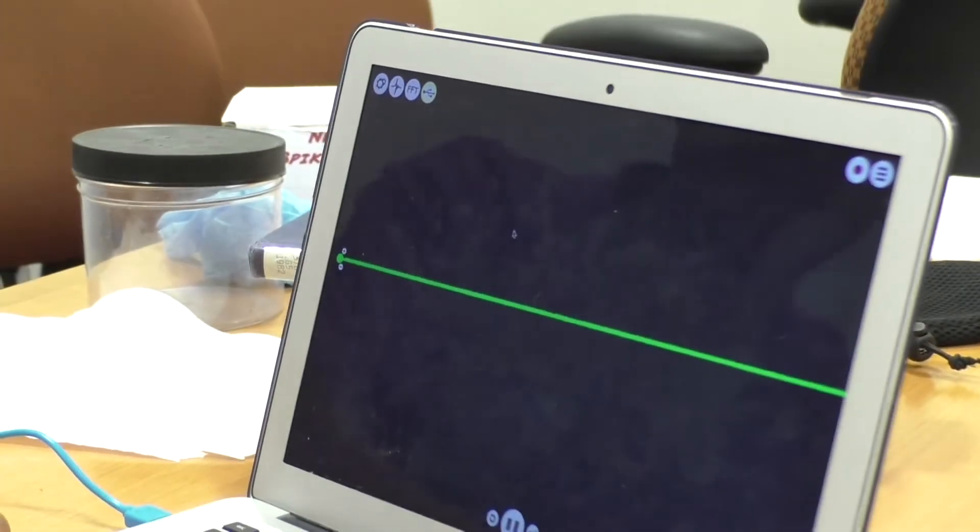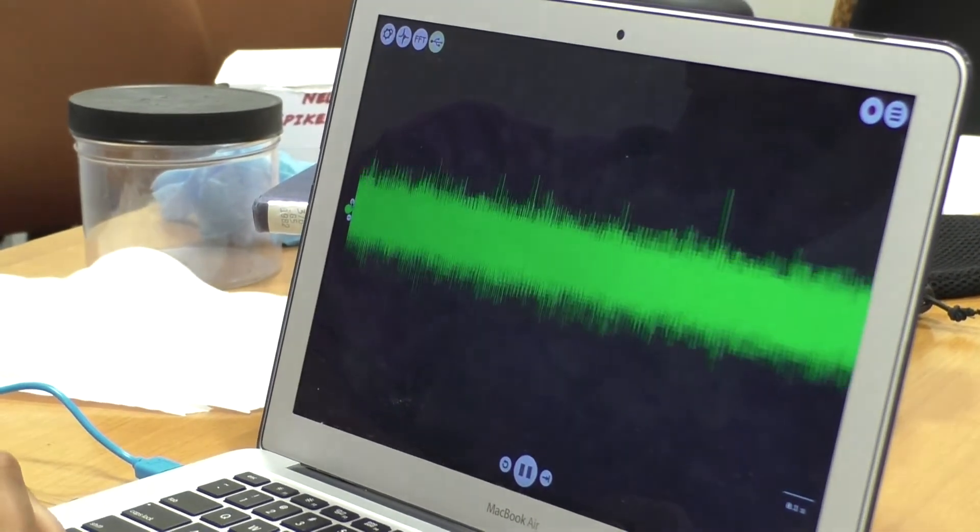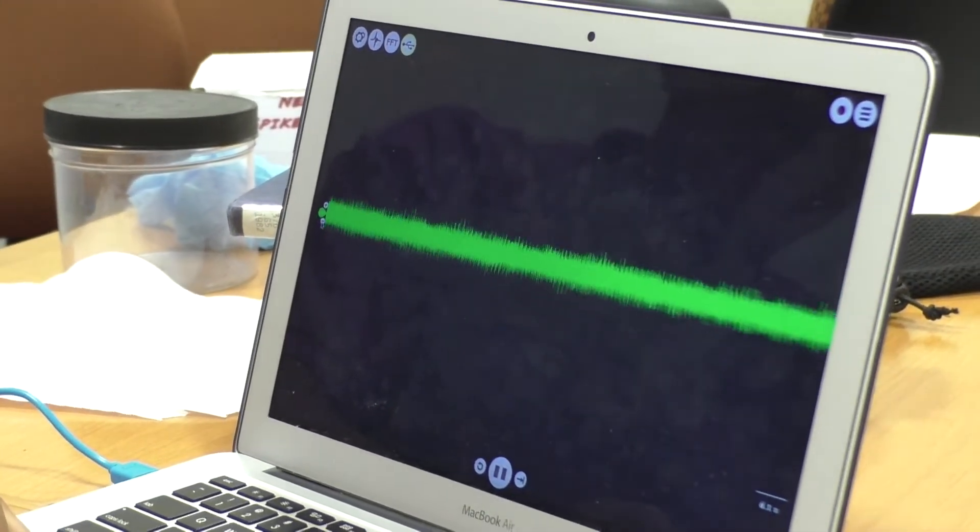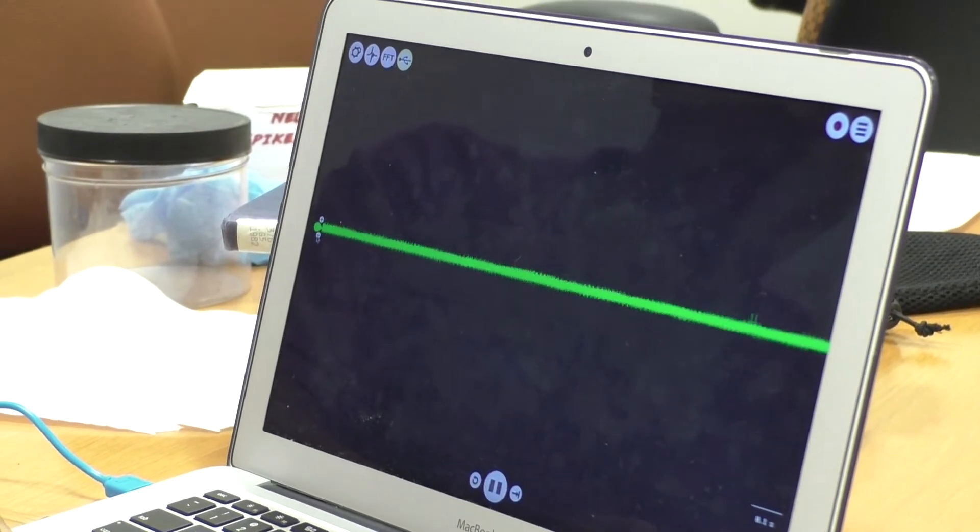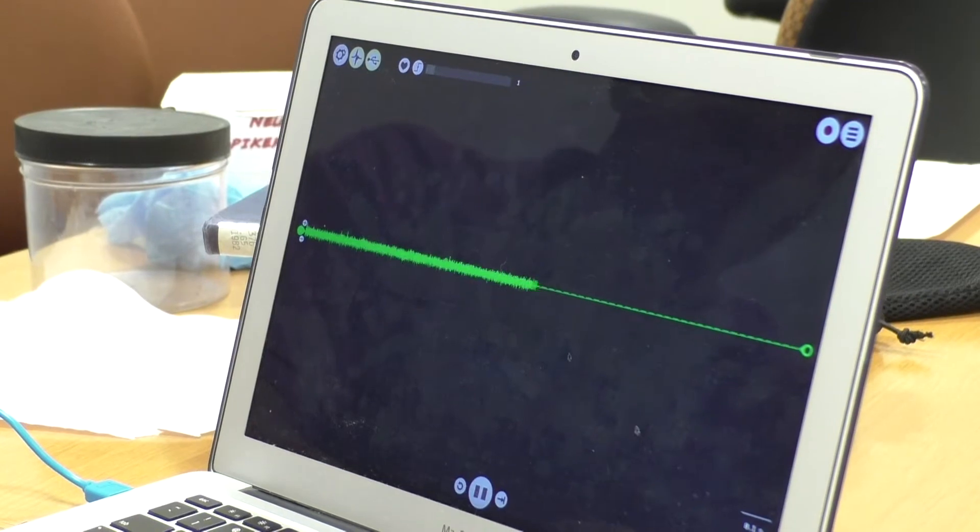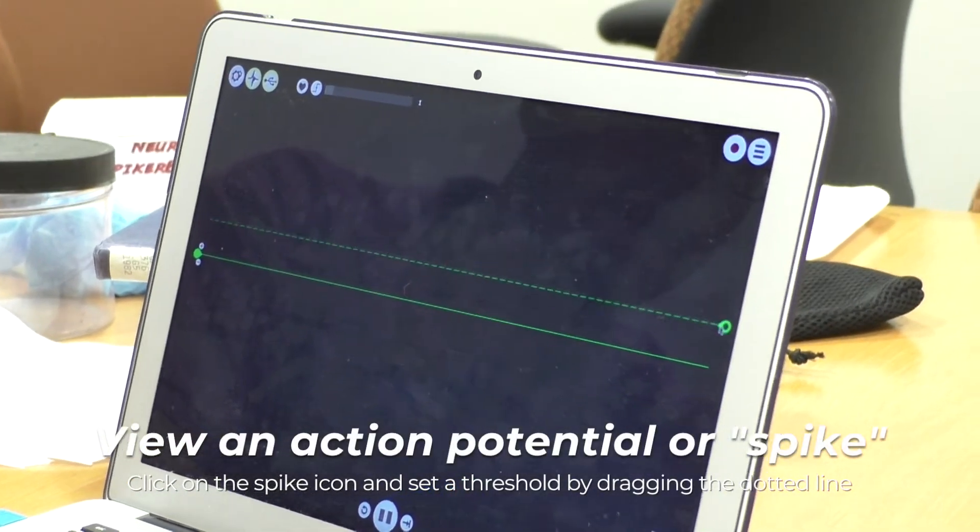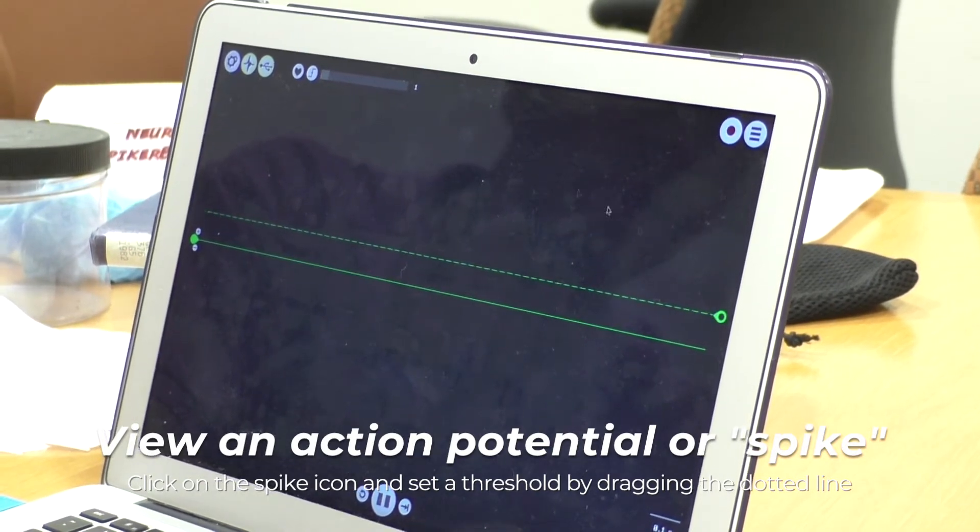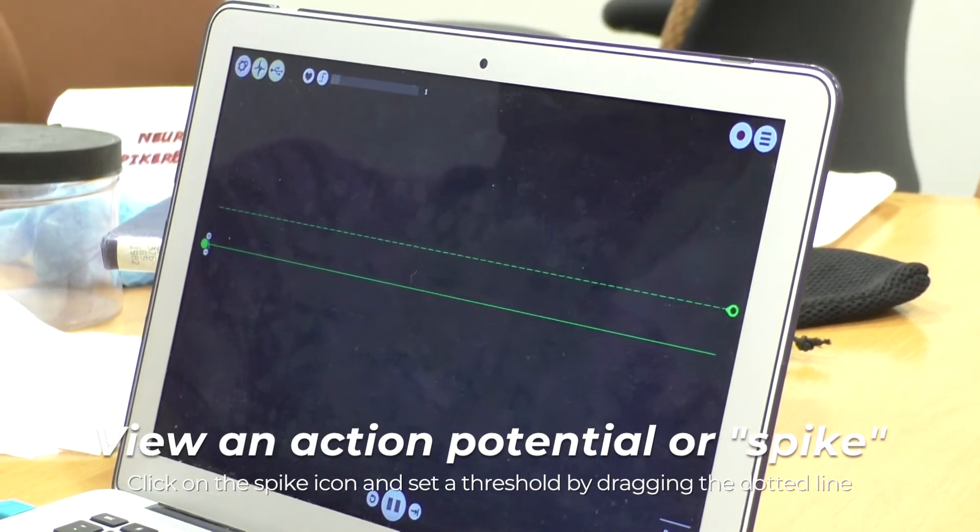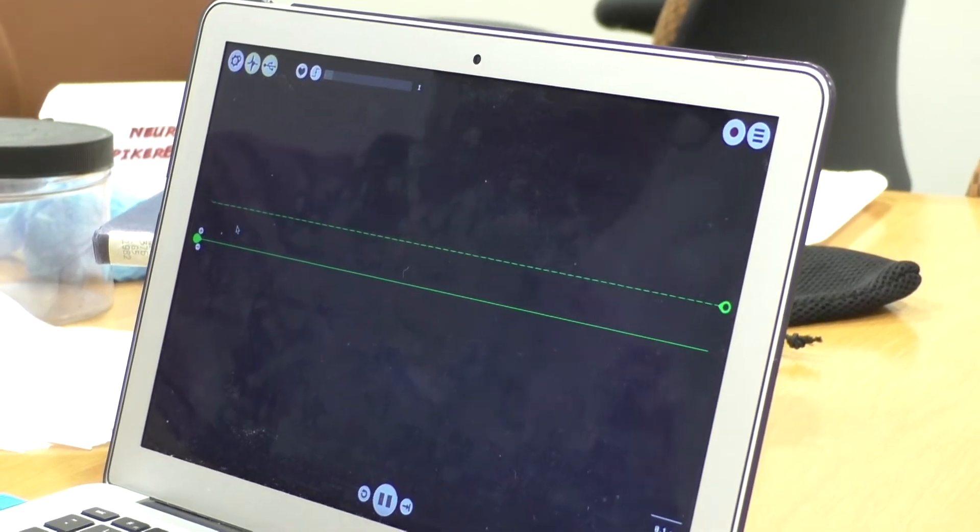So now we just have the one line. And like I said, you can make it wider or smaller. In addition, you could make a threshold by clicking on this button. And then raising or lowering this line. And that will give you a threshold for when you'll see a response. So if the threshold's up there, you'll only see a response when it goes that high.